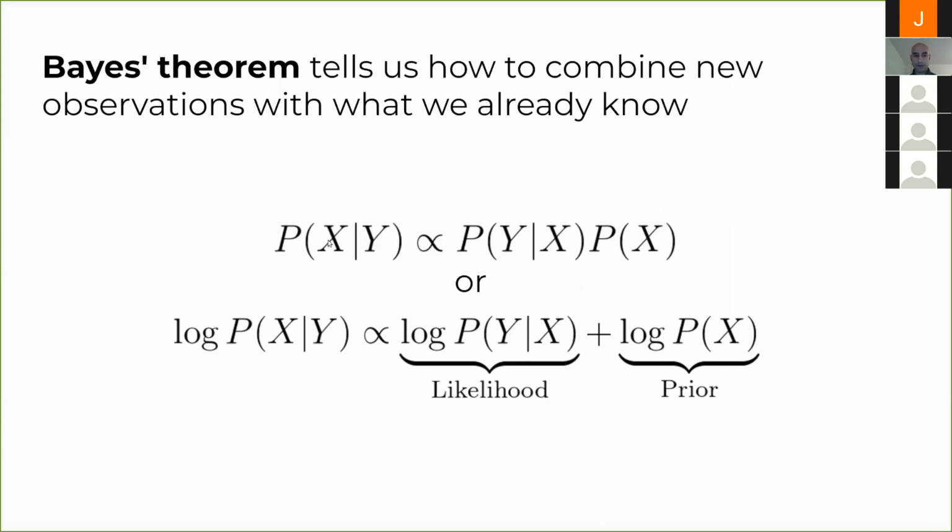The probability of that model given your data is proportional to the flipped probability, where the model is given, the probability of that data given that model, times this little thing here, which is the probability of that model in general without the data given. And this is commonly called, so this would be the posterior, this is the likelihood, and this would be the prior probability. And this talk will be much more focused on the prior part, which hasn't been really addressed that much in cryo-EM.